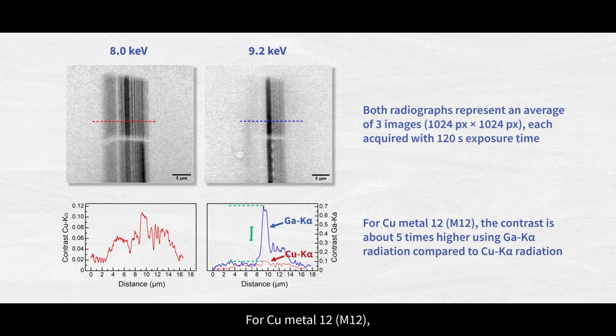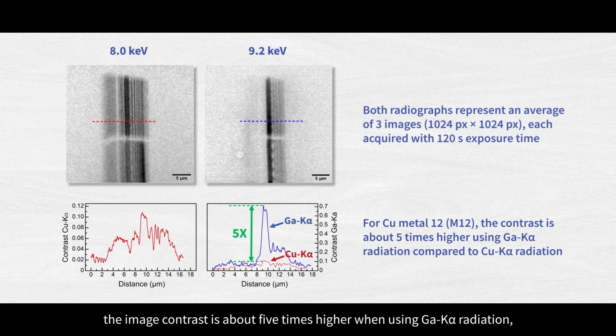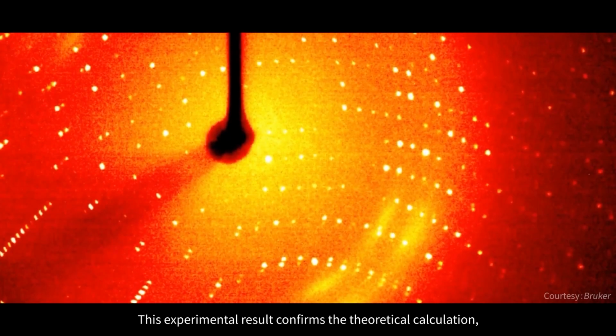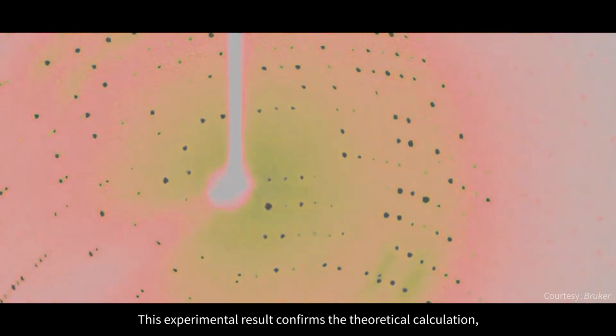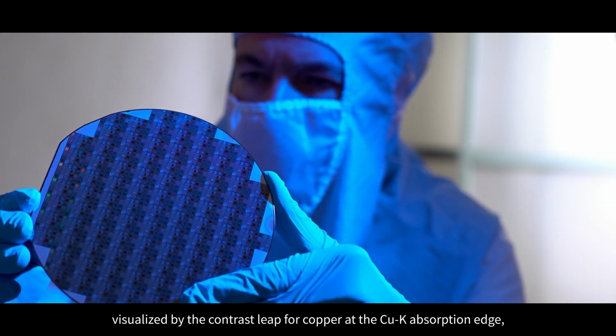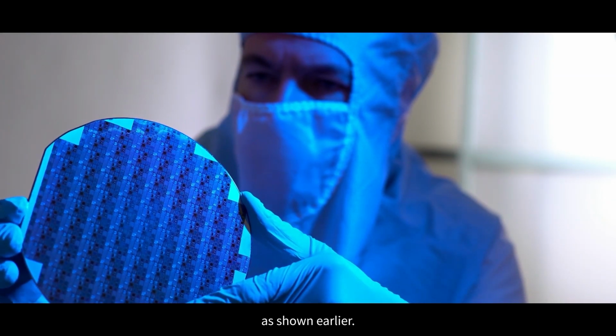For copper metal 12, the image contrast is about 5 times higher when using gallium K-alpha radiation, compared to copper K-alpha radiation. This experimental result confirms the theoretical calculation, visualized by the contrast leap for copper at the copper K absorption edge, as shown earlier.